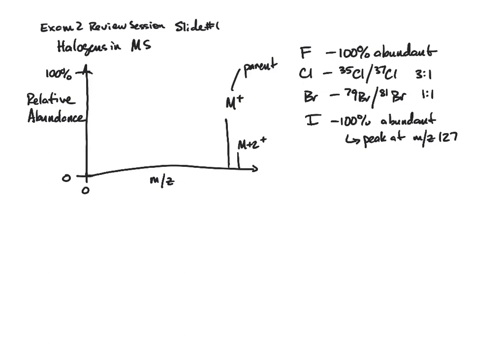So mass spec, if anyone wants to go into any sort of analytical chemistry, is pretty powerful. The job that I used to work in, we would take compounds and label them with carbon-14 or tritium atoms, which are radioactive. So with carbon-14, you get an M+2 signature, and it's radioactive as well, so you can detect the disintegrations.